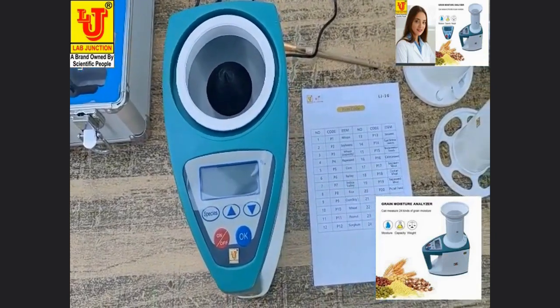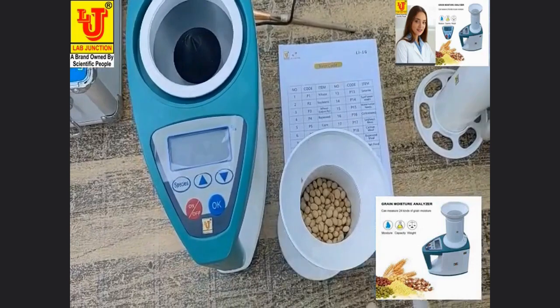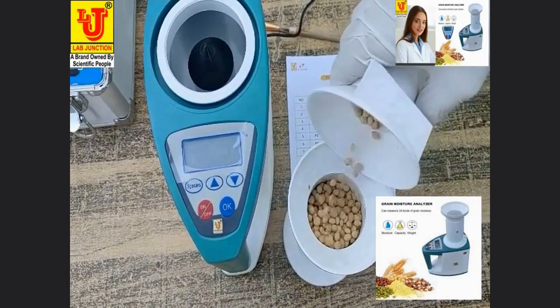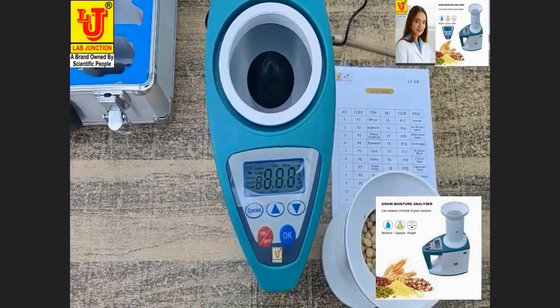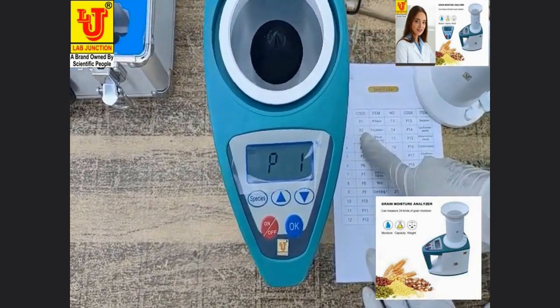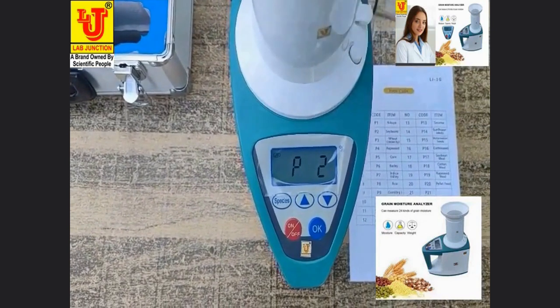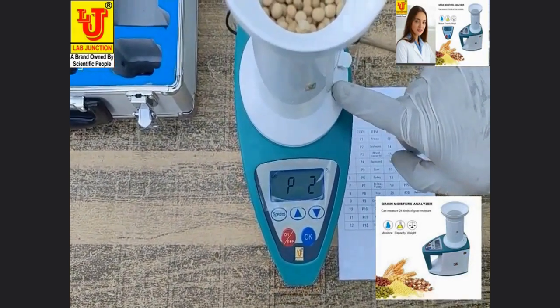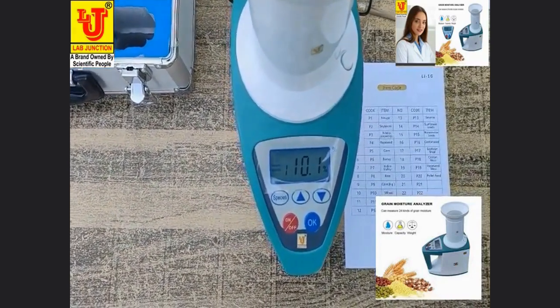Now I am measuring soya bean moisture. Switching on the instrument. Soya bean code is P2. Selecting P2 and pressing the key — directly, moisture of soya bean comes: 10.1%.